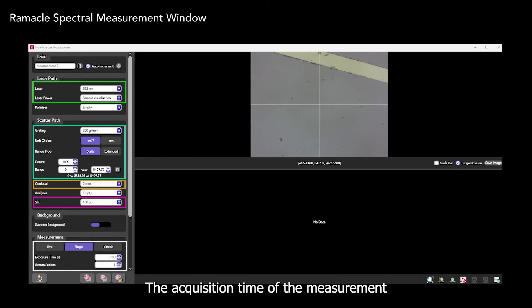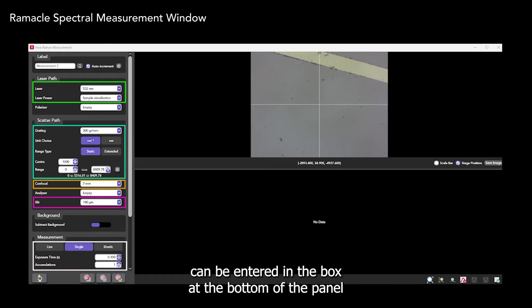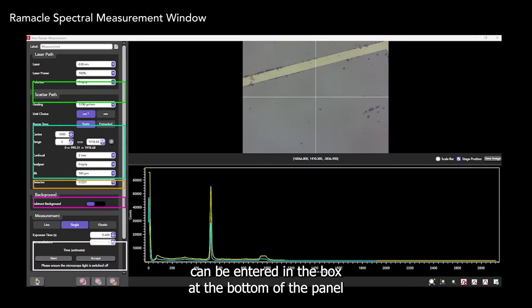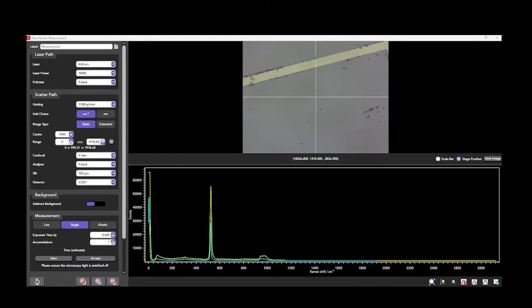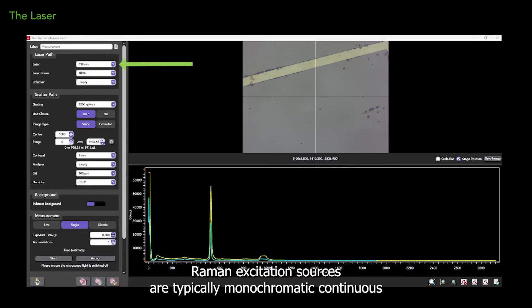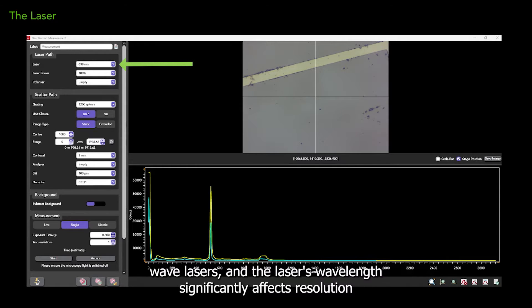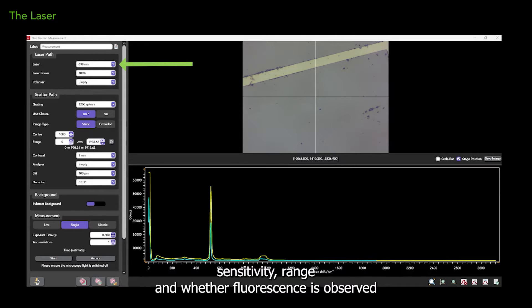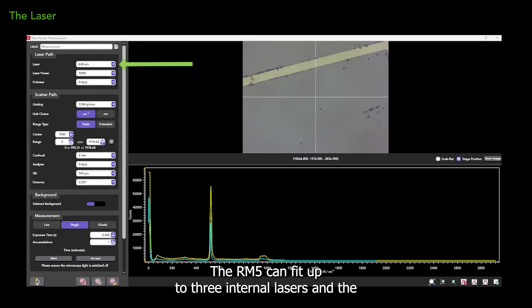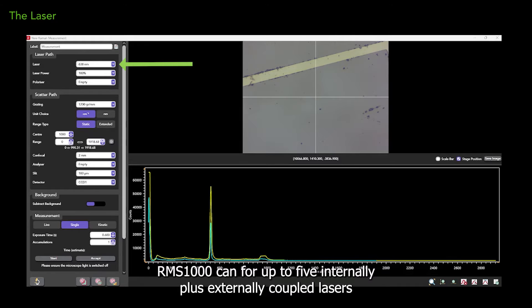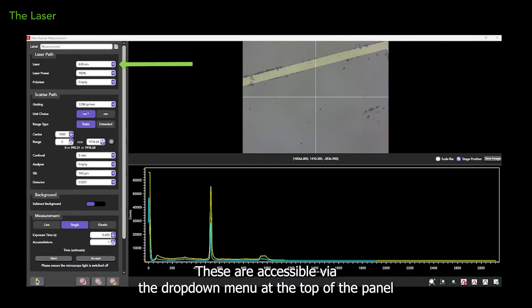The acquisition time of the measurement can be entered in the box at the bottom of the panel. Raman excitation sources are typically monochromatic continuous wave lasers, and the laser's wavelength significantly affects resolution, sensitivity, range, and whether fluorescence is observed. The RM5 can fit up to three internal lasers, and the RMS1000 can fit up to five internally plus externally coupled lasers. These are accessible via the drop-down menu at the top of the panel.